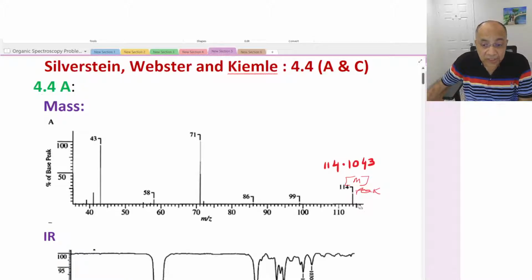So here the M+2 peak is almost undetectable. The M peak suggests that there is no bromine, no chlorine, no sulfur. Otherwise, there must be an M+2 peak, but here the spectral data doesn't show any peak.